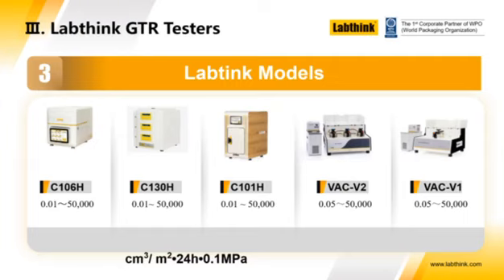And so although the temperature control device, which you can see on the left there, is a circulating water bath capable of heating the machine up to 90 degrees Celsius, the data curve fitting function enables us to take 3 measurements within the standard range of temperature control. So we take those 3 measurements at some 3 points up to 90 degrees centigrade.